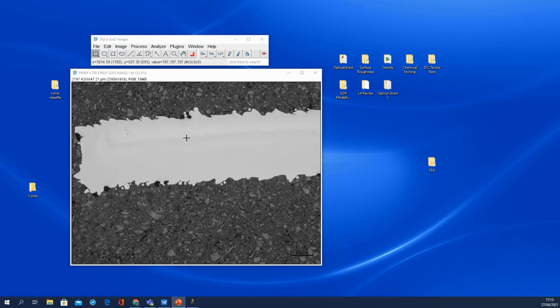So now what I'm going to do is create multiple ROIs, and I'm going to end up with my final ROI that's just an outline of the actual strut itself. But to get there, the process is a little bit tedious. So I'm going to create my first ROI using the polygon selections tool.